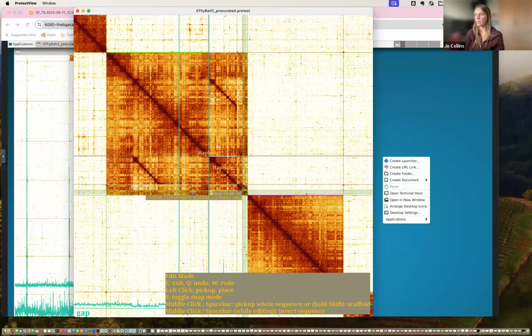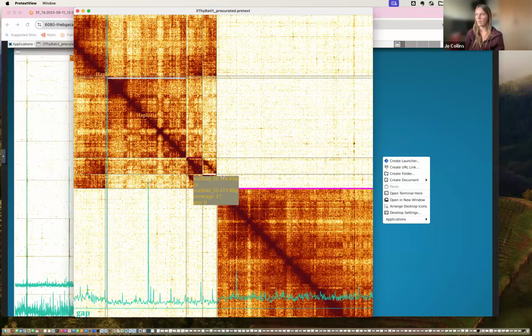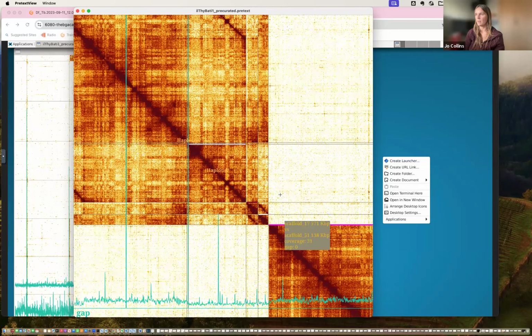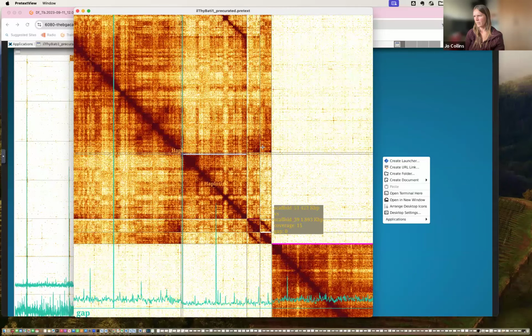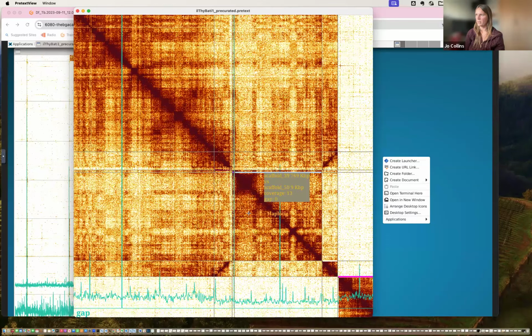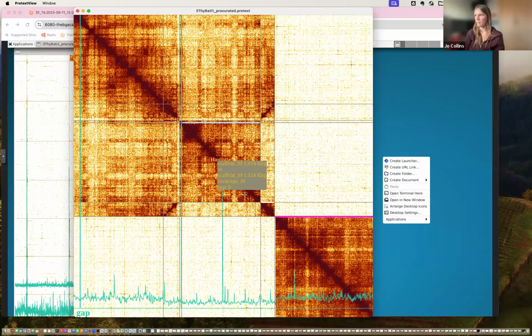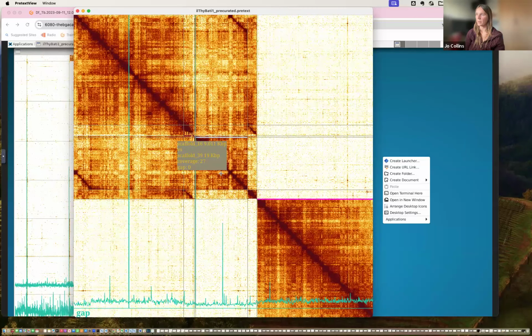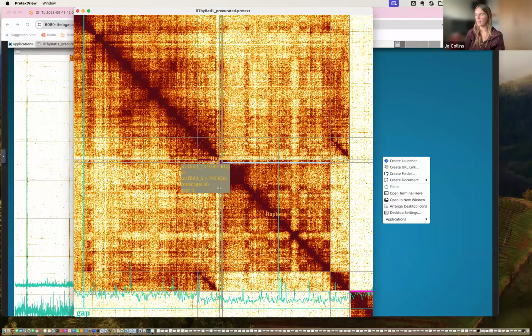And once I've moved them, you can see what I was talking about. So actually these two pieces, we could tell because they both wanted to go at the same end of our primary scaffold. These two pieces are actually haplotigs of each other. So we only want to keep one of those. So that one has a stronger match. It doesn't really matter which one of those. I've just kept the longest one because it's the same sequence.